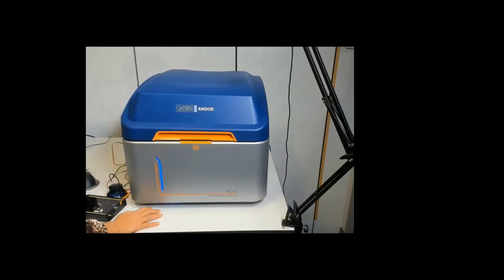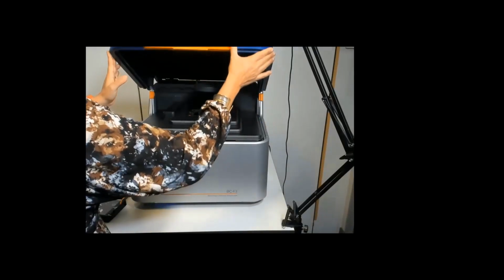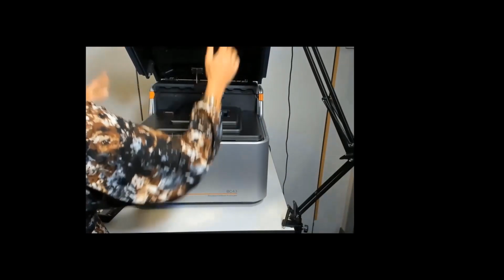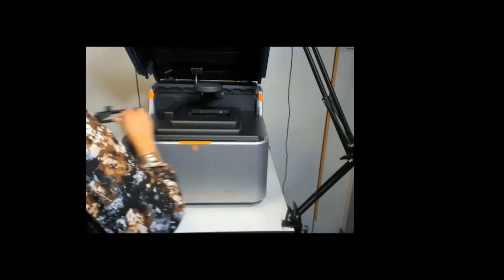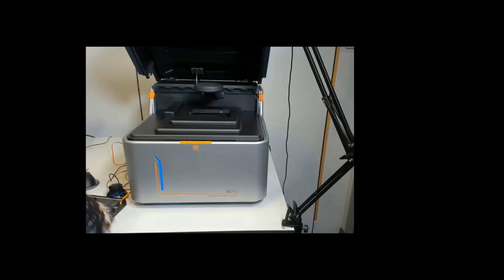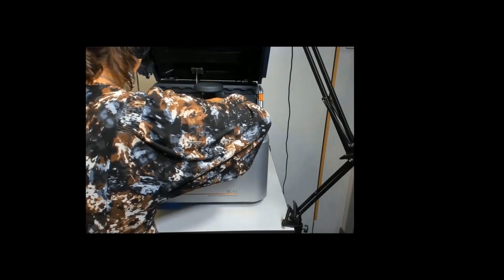And now I will show how to add the incubator, the Ocolab incubator, and how to add oil using the incubator. So I'm starting to open the lid of the Andor benchtop confocal, and I remove the previous sample holder. I will now add the incubator box.